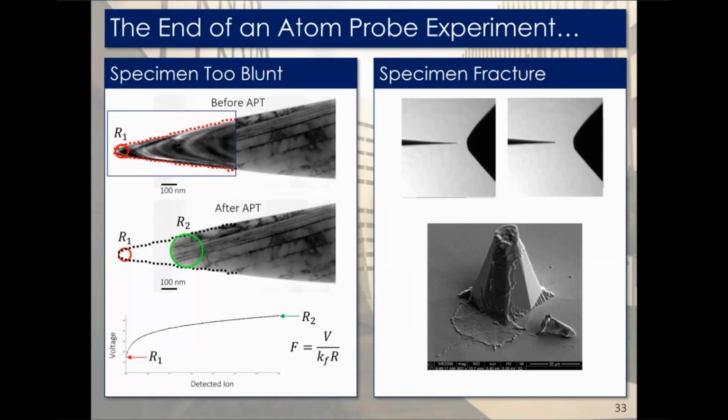So hopefully, before a fracture occurs, you've got your data, but if you don't, then that's why usually we just do repeats, not only to confirm our data, but to make sure that we get our data and we get good yield without getting these sample fractures. One of the reasons why we'll always do these kind of series of tips whenever we do a FIB lift-out or stuff like that. So once we have our data, then we would move on to the reconstruction stage.